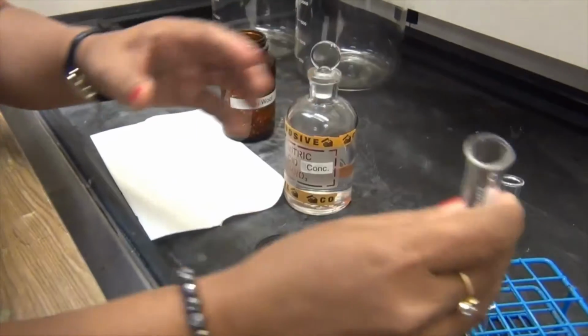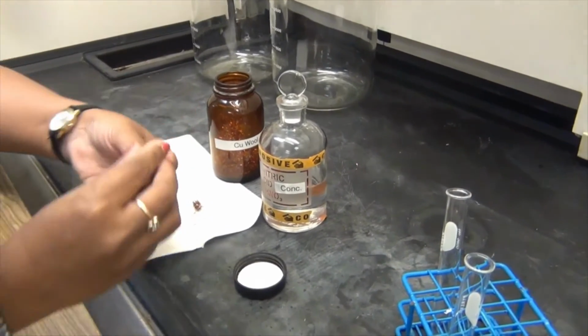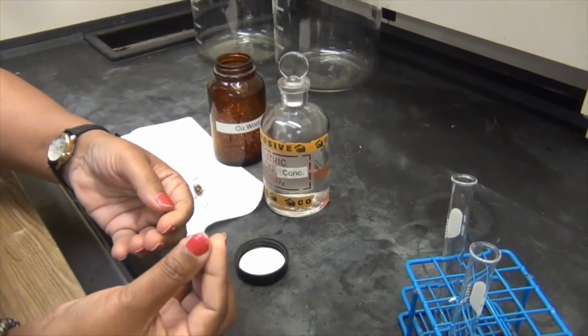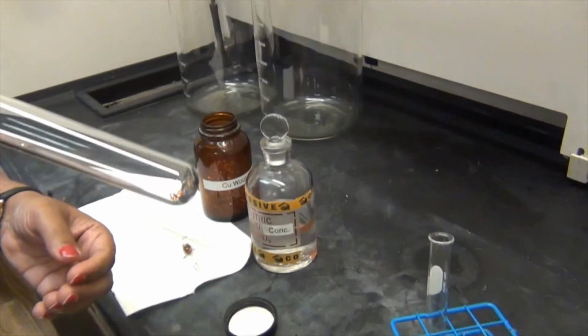And I have a feeling I should take a little bit more because then you can see some nice reactions. Otherwise, it might be a little hard for you. So I'm just going to take a little bit more, make it into a bead. There. I don't need gloves for this, so I know you're probably thinking she's not safe. I am safe, I promise you that. Okay, so we have little beads over here now.